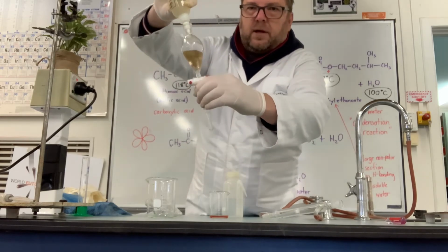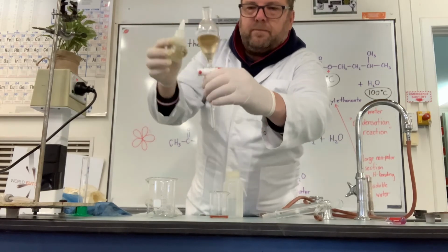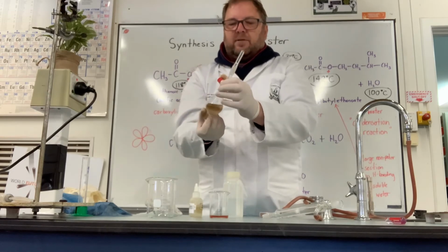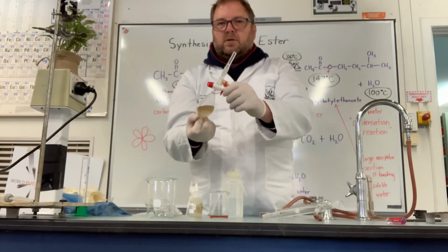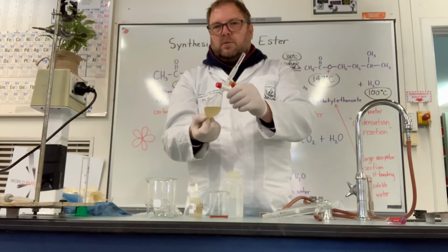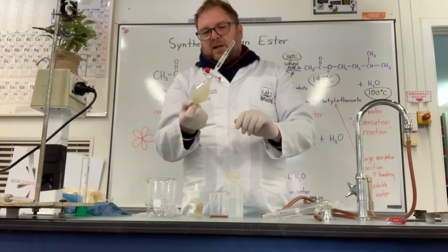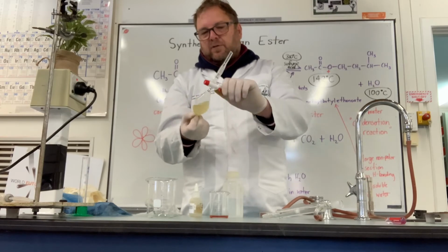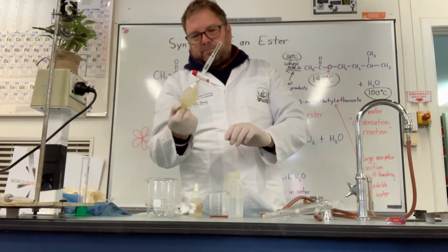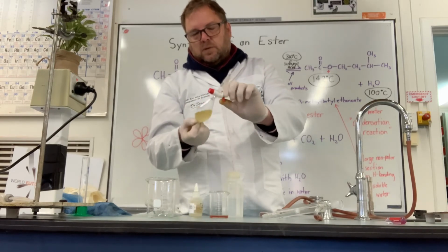You can see as I add that, we're getting effervescence, which is indicating there's some acetic acid in there reacting. Then I'm going to put a stopper in here. I've got to hold that stopper quite firm because it will create gas. I'm going to mix it. Hear that little burst of gas coming out. That was the carbon dioxide gas that formed. Even bigger burst. While we're still getting that gas produced, that's showing that there must still be some acetic acid in there reacting, forming carbon dioxide. So we'll keep going.